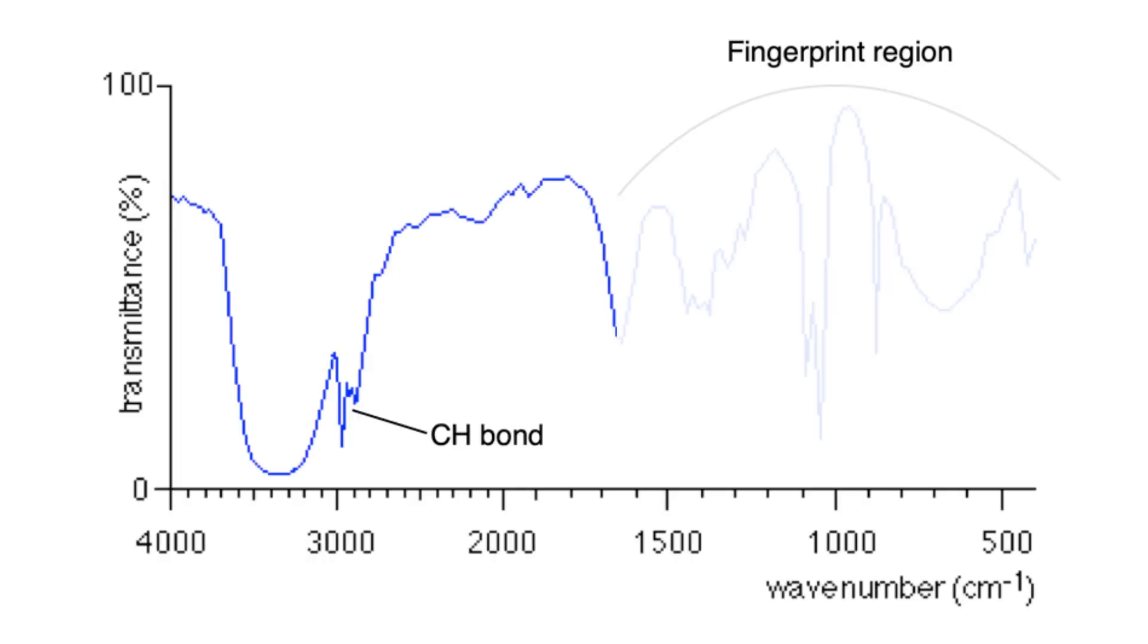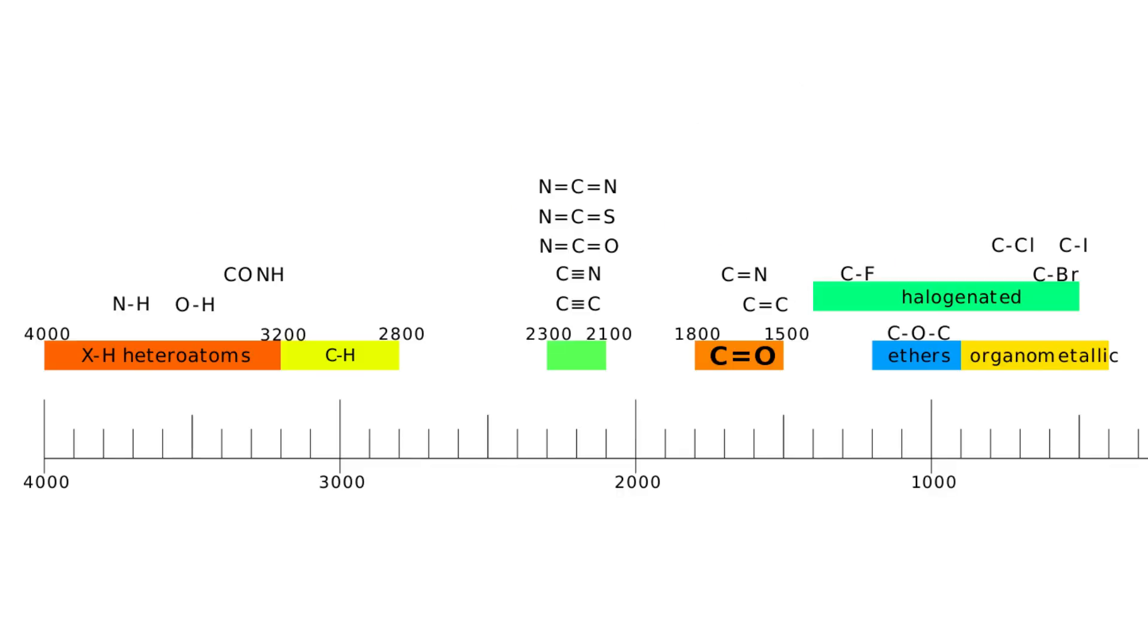This is immediately followed by a broad dip between 3200 to 3600 but more precisely I'd say 3400 to 3600 around there. If we again look from the correlation table this will correspond to an alcohol group.